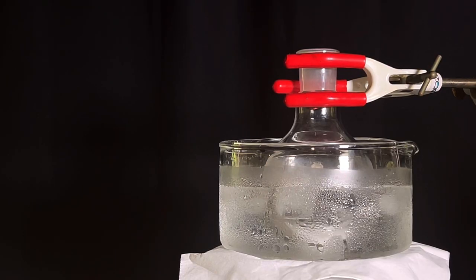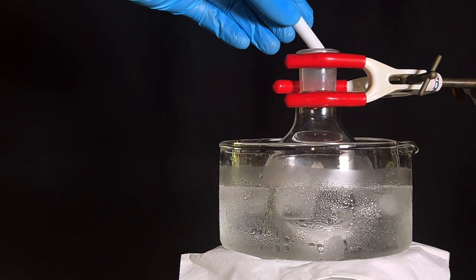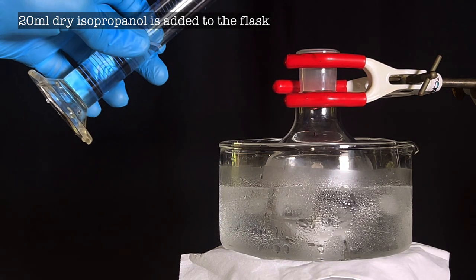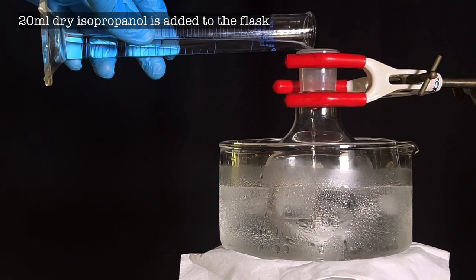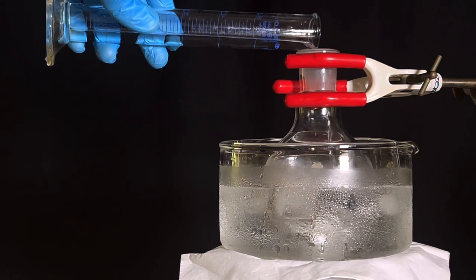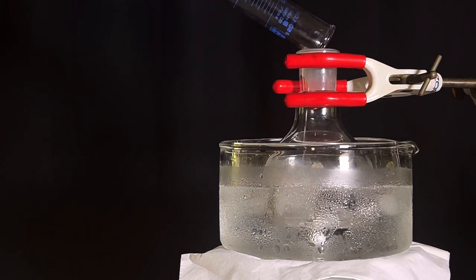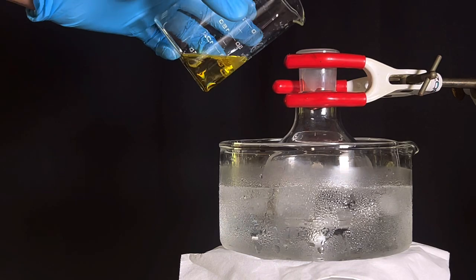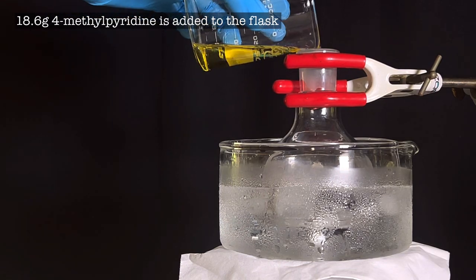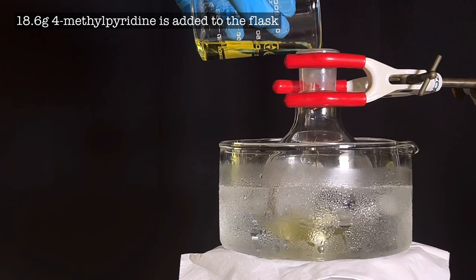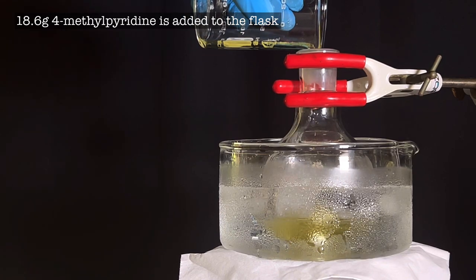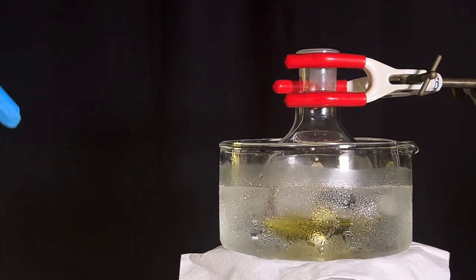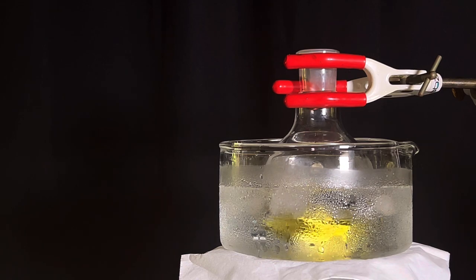Start by clamping a 100 milliliter round bottom flask in an ice bath. Add a magnetic stirring bar inside. 20 milliliters of dry isopropanol was measured in a graduated cylinder and was transferred to the flask. Magnetic stirring was then turned on.